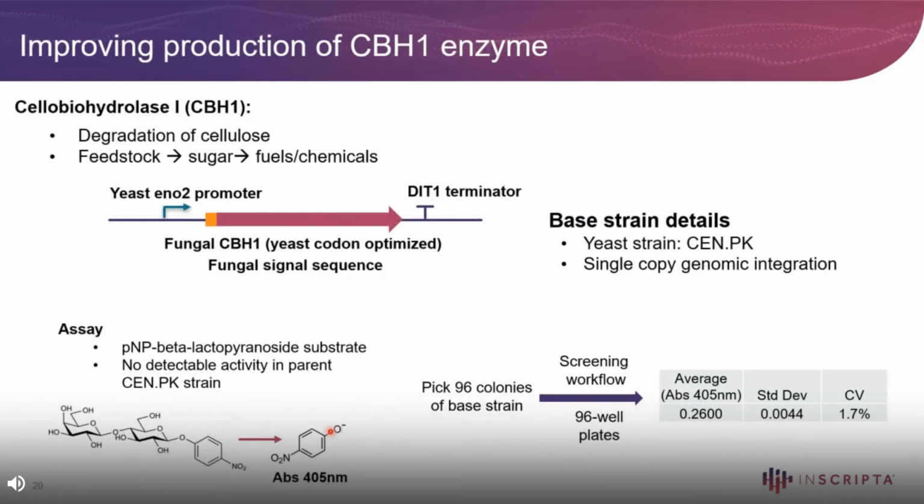So we wanted to come up with an application to test this out, and we decided to use our model enzyme, an enzyme called CBH1. So this is a cellobiohydrolase 1. It's an enzyme that's involved in cellulose degradation.